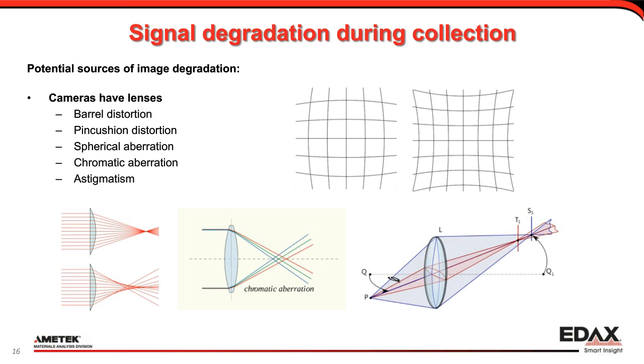Of course, we always try to get the best possible lenses, but we also try to get the best sensitivity. And the best, most uniform lens performance is when you use the center of the lens as much as possible. The more you go towards the edge of the lens, the more deviation you may get from the ideal imaging. So those two parameters actually clash.